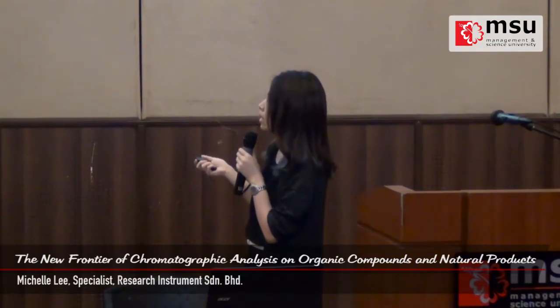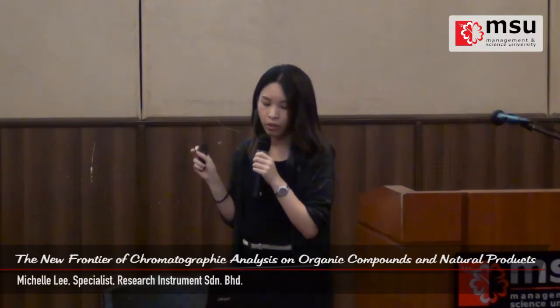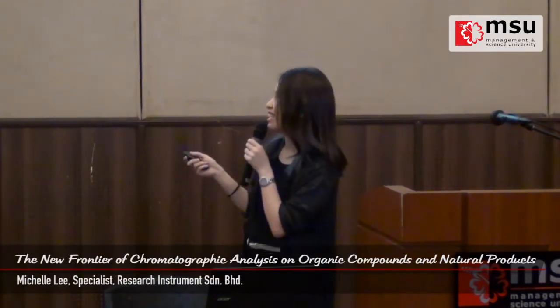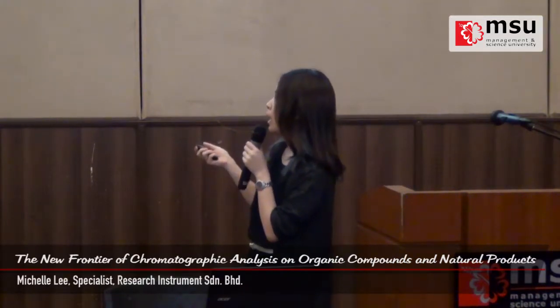Okay. So this is an example of thin layer chromatography results using a manual technique. So in your opinion, do you think this is a good result? No? No one say yes? You all have very high standards. Okay, so this kind of result, let's say I submit this to the regulatory people. It depends very much on the regulatory people whether to accept it or not, because somehow it doesn't really look that satisfying. But how about this?